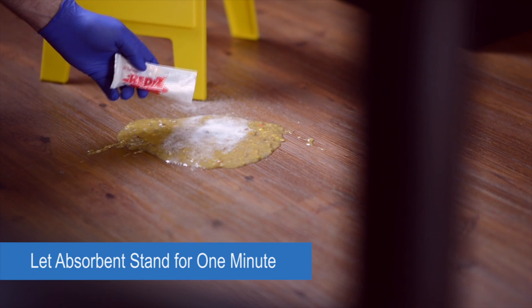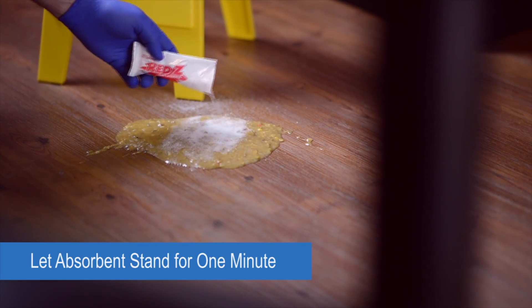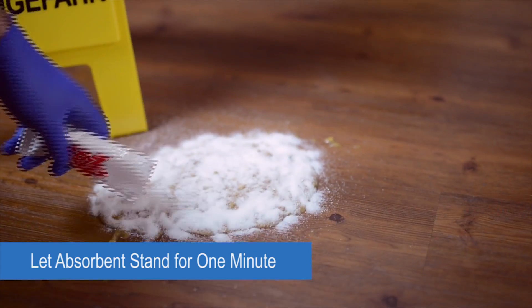Sprinkle the Red Z absorbent material over the spill and allow it to stand for at least one minute, or until the spill is completely gelled.